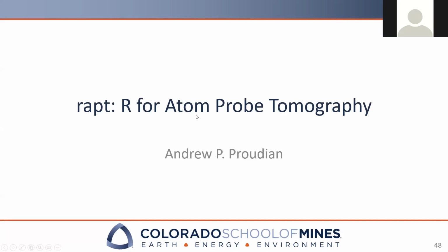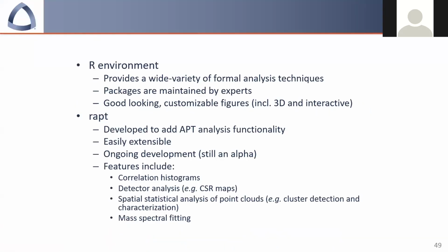Okay, so I just want to give a brief introduction on what motivated us to use R to develop this package. R is an open source language that is really used by the data analysis and statistics community, and provides a wide variety of packages and modules to perform particular analyses. It's really been developed for rapid data analysis and visualization techniques, including things like interactive plots, 3D plots, et cetera.